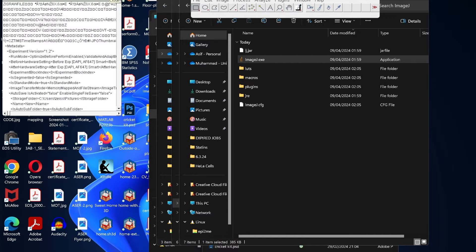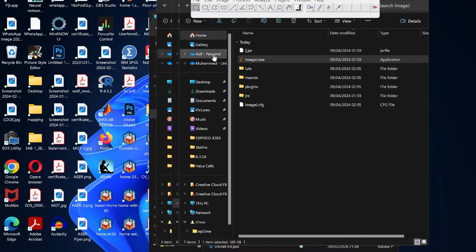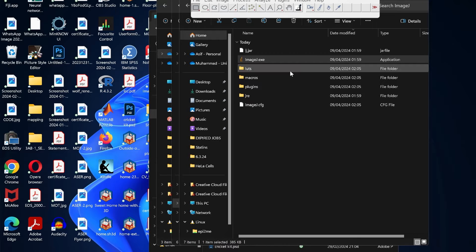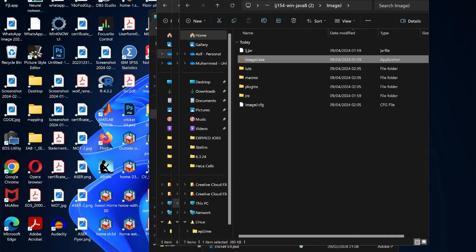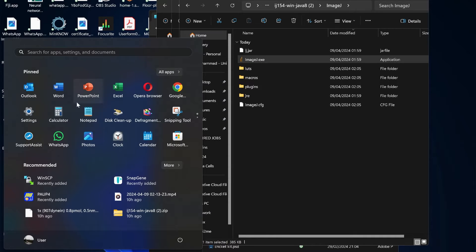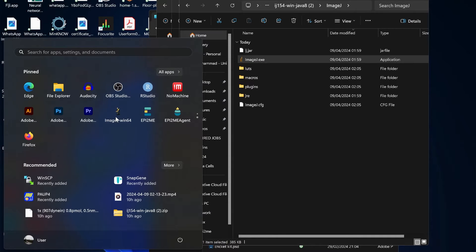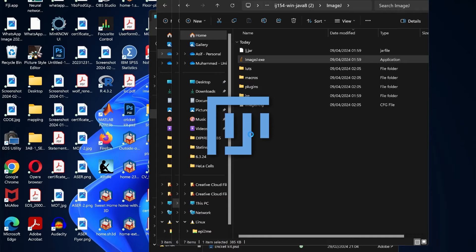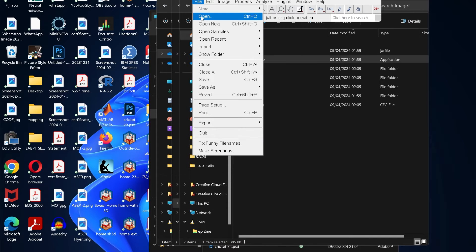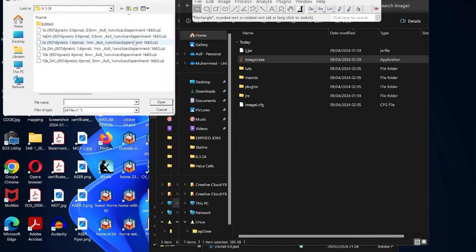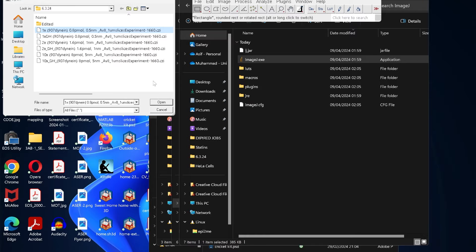ImageJ cannot open the CZI format because of proprietary reasons, so we have to use Fiji for that. So we go and open Fiji, and then again click on File > Open, and select any one of these CZI format files.